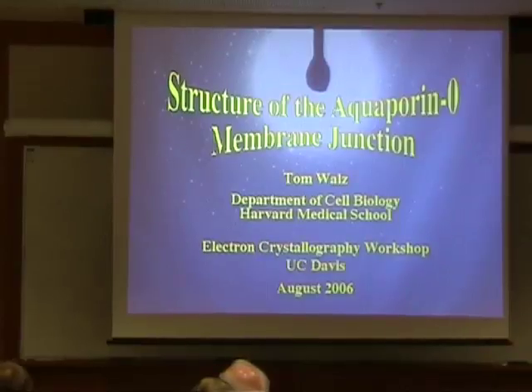Maybe if I have a little bit of time, I can show you a little bit of new data that collaborates with that protocol. The title was very general, high resolution membrane protein structure, so that means the structure 4.0, there's nothing else. But anyway, what I'm going to talk about is the structure of the membrane junction formed by AQP0.